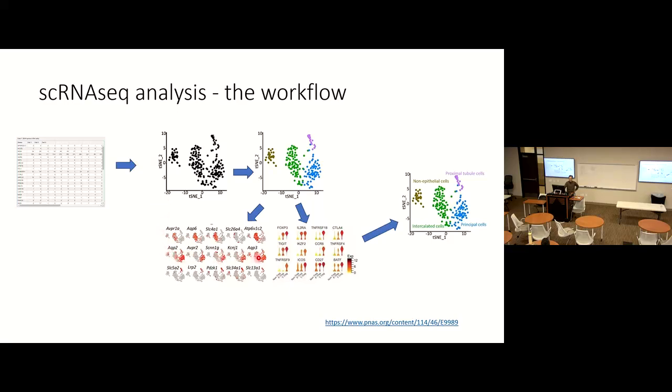So if you have these genes co-expressed, highly expressed in this population, then you can assign a cell type to this group based on your marker gene expression. So that's from the matrix to the cluster and the cell type annotation. That's a very basic step we are going to do before we can compare using cell type specific methods. You have to know, okay, this group is this type of cells.